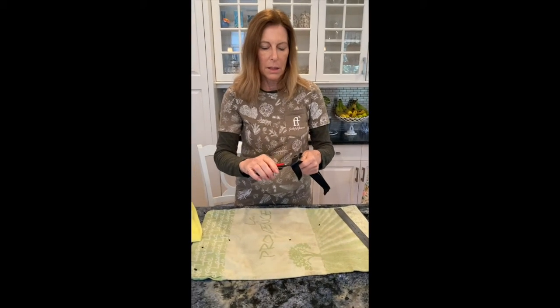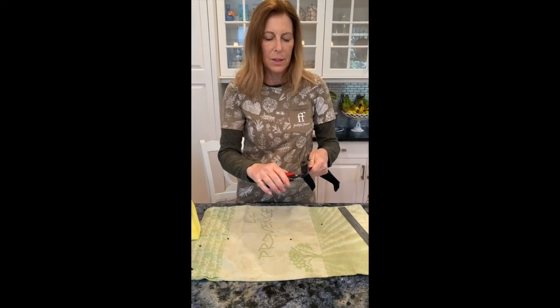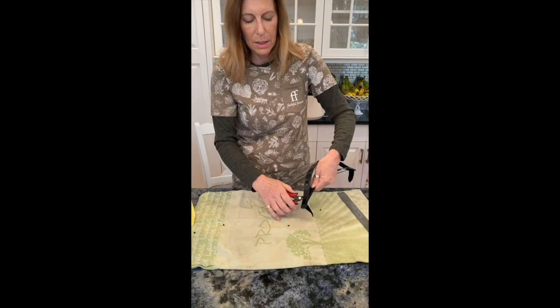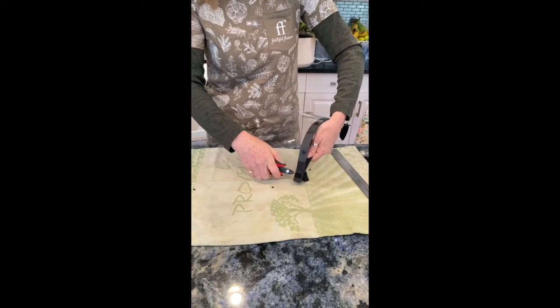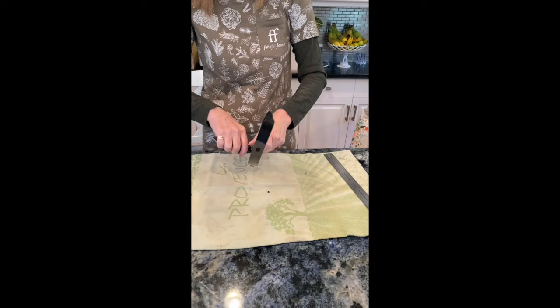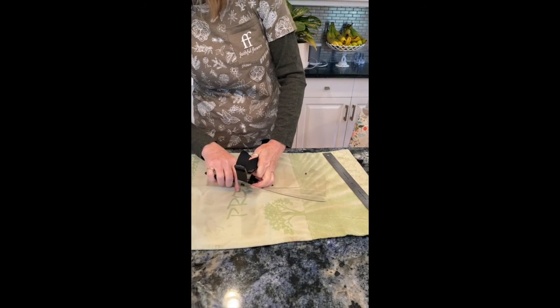Now here we go with the little clippers. We're just going to clip off the ends — don't go all the way down, leave a little bit. I'm just going to clip off the ends here, like that, just all the way around, and you're pretty much done.